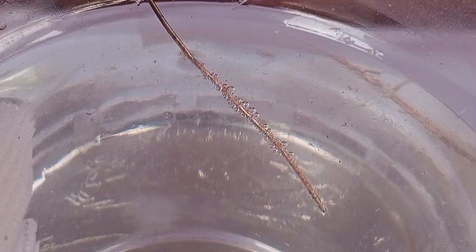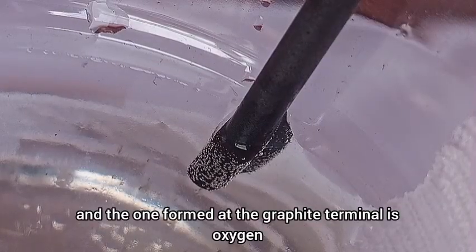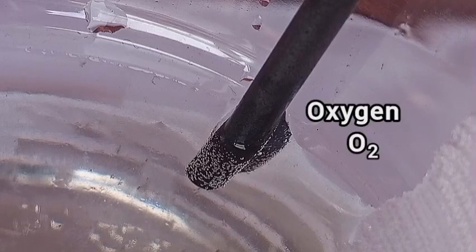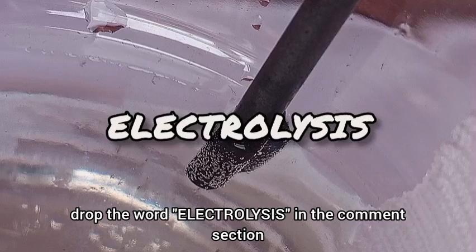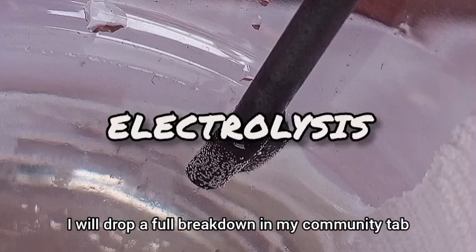The gas formed at the copper terminal is hydrogen, and the one formed at the graphite terminal is oxygen. If you want me to go in depth into how this process really works, drop the word 'electrolysis' in the comment section, and once I see enough of them I will drop a full breakdown in my community tab.